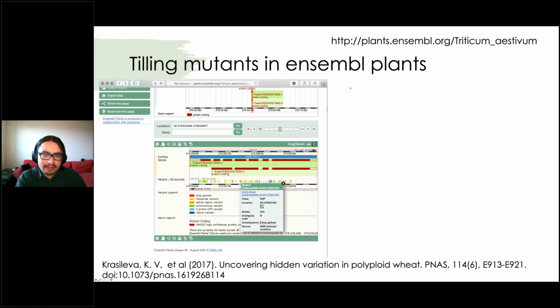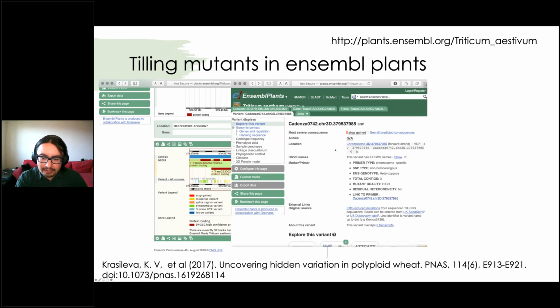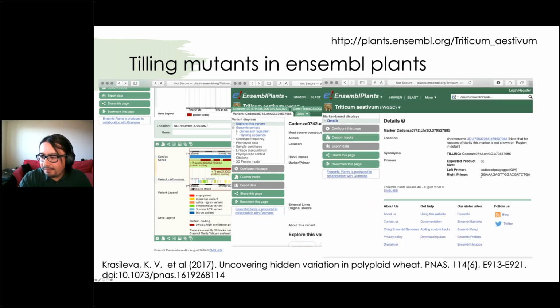So now we have partnered with Ensembl, and they host all these SNPs, and as part of the data that we make public via Ensembl, it's also the results of PolyMarker. So you also know if the SNP can yield a chromosome-specific primer, and if the SNP is really non-homologous, that means that it's a real SNP and not a difference between the 3 chromosomes. And we also give the set of primers already calculated, so you don't need to go back and run PolyMarker for the mutants that we have identified. We have run it already for all the mutations that are available.